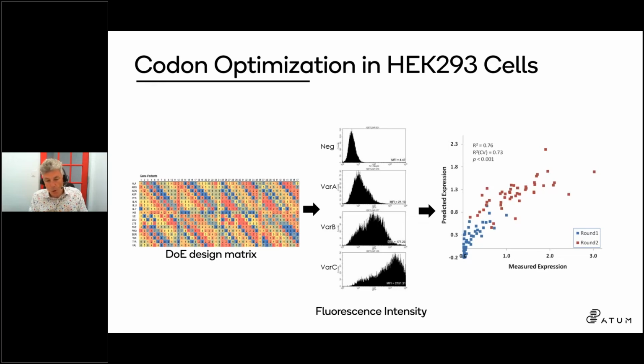And again, there's no correlation whatsoever to common codons, but certain codons are just very important, and certain other variables are very important. So we see here in blue is the data set generated from this first DOE matrix. And off of that sequence, we made a second round that we drilled down further into certain codon biases. And we see another 5-fold or so improvement of expression as a function of recoding the sequences.